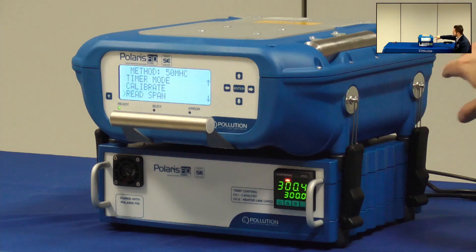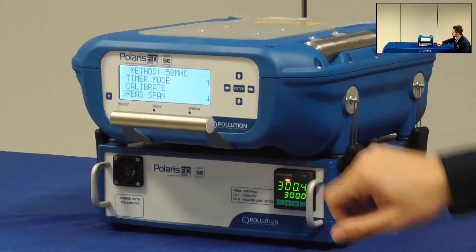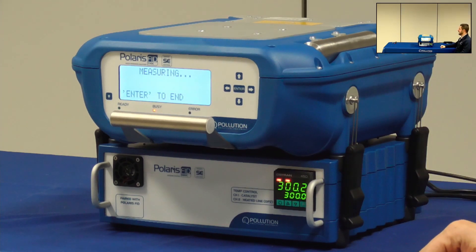I can decide to use the integrated span cylinder or an external gas tank. On the display will now appear the span gas concentration and I'll wait a few measurements to be sure to get a stable value.